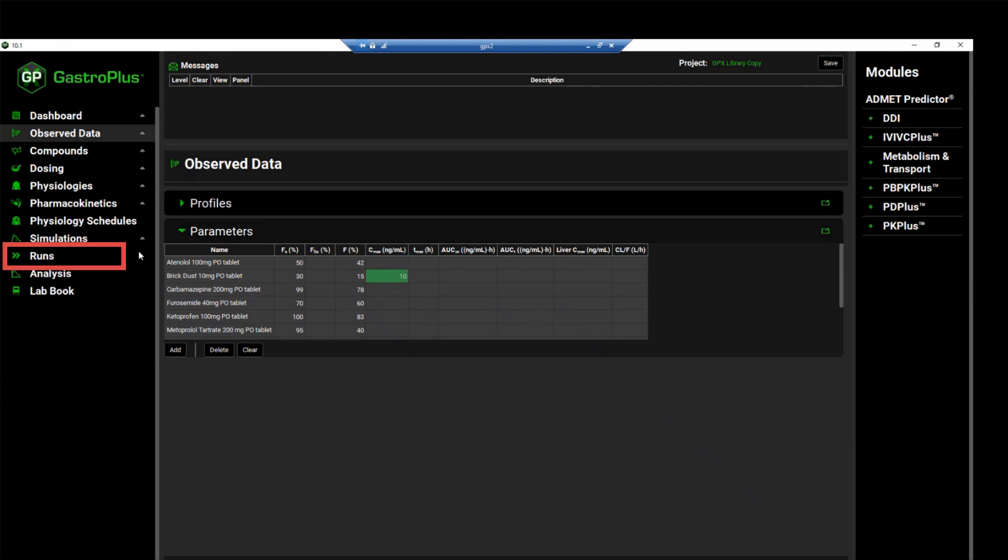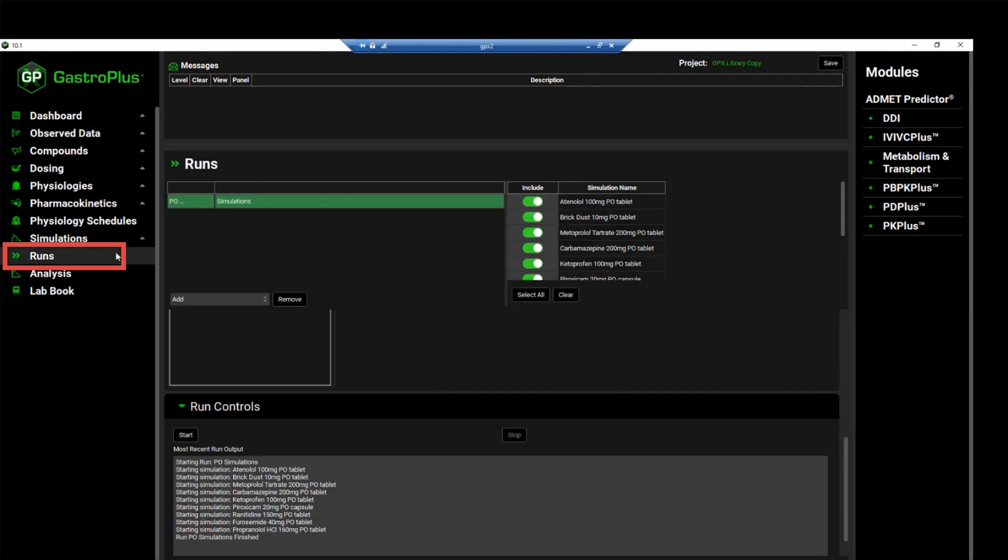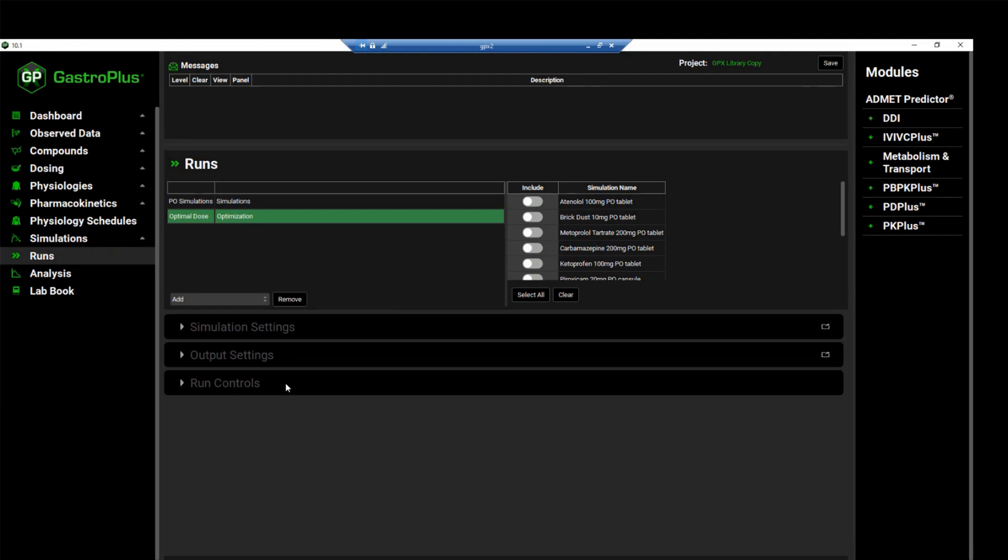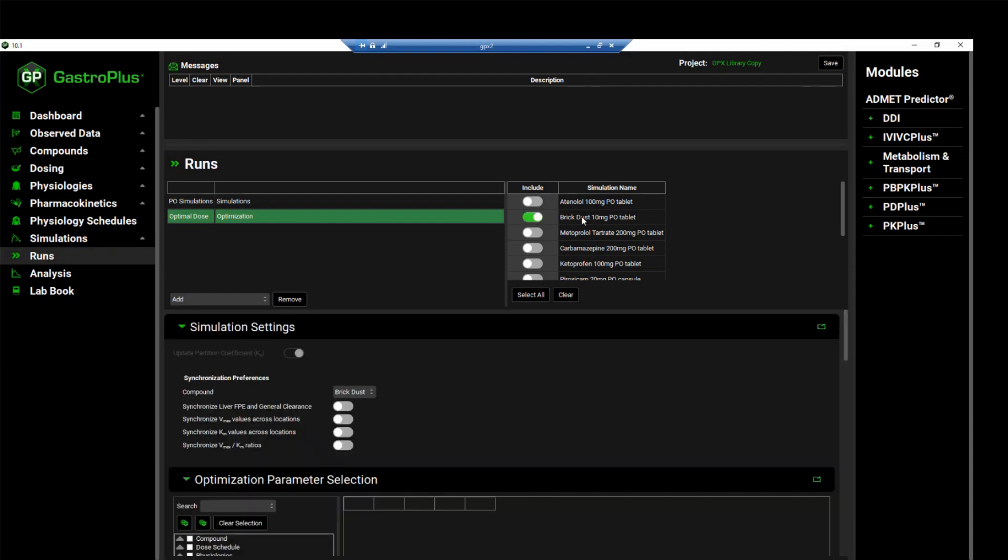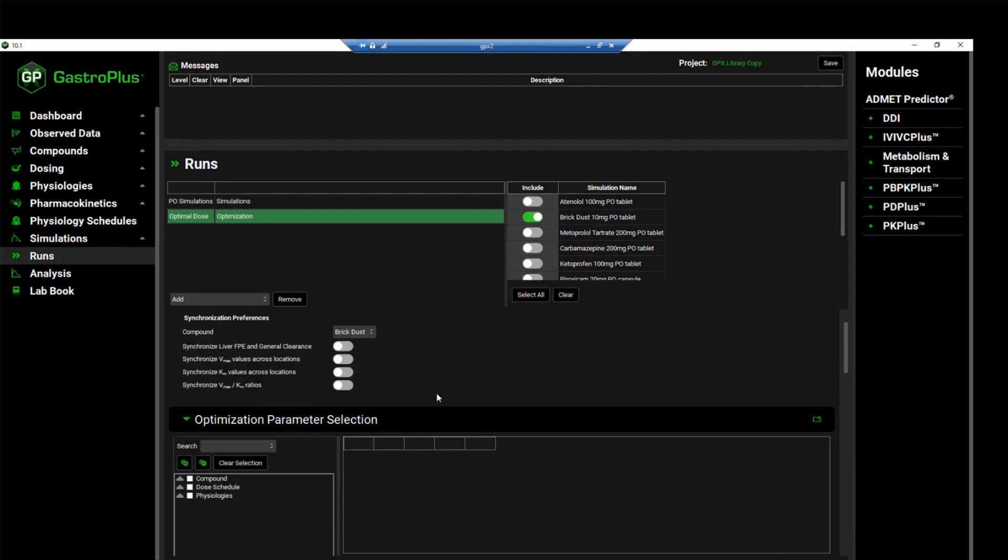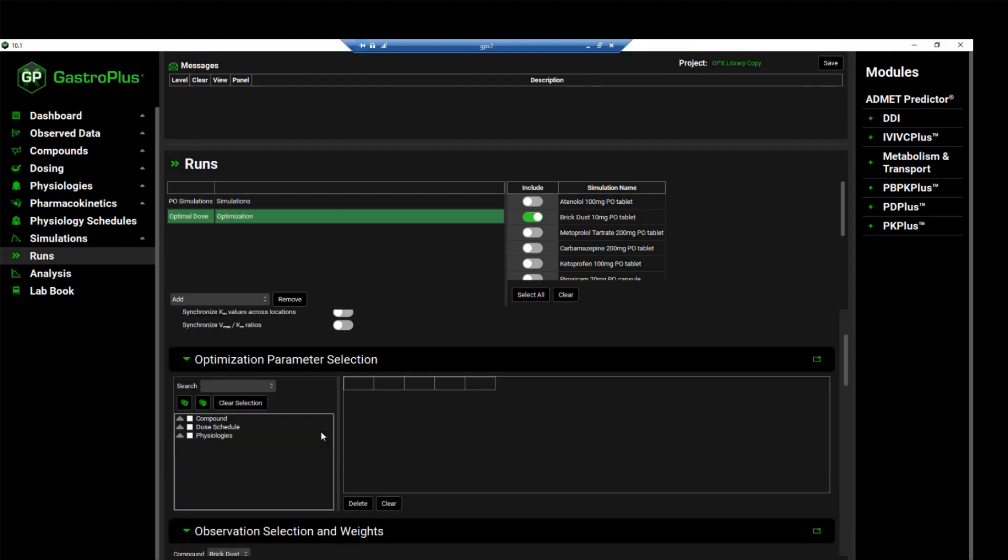We will come back to the runs view and we'll click on add to select the optimization run type. We will call it optimal dose and then click OK. Since we just want to select the brick dust simulation, we will simply select the include toggle next to the brick dust simulation name.